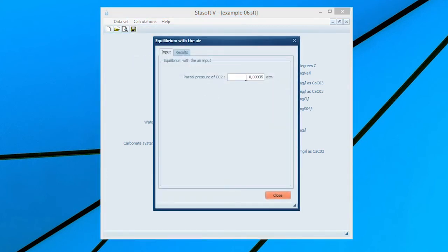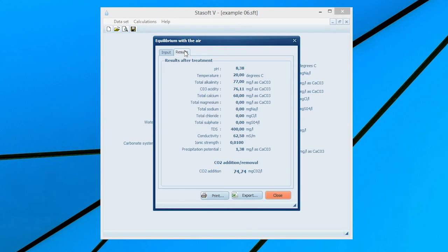Enter the partial pressure of carbon dioxide in the air by typing 0.00035 or accepting the default value into the partial pressure of carbon dioxide input box. Selection of the Results menu option will bring the Results After Treatment window onto the screen with values for the new state of the water and amount of carbon dioxide lost or gained by the water.